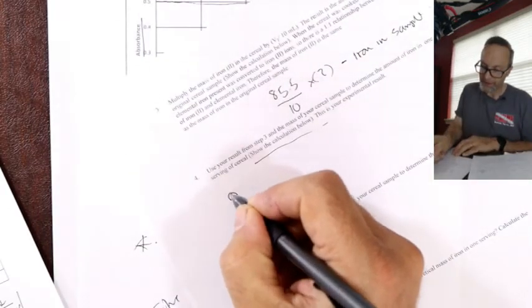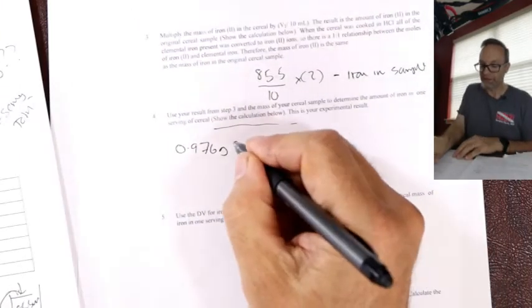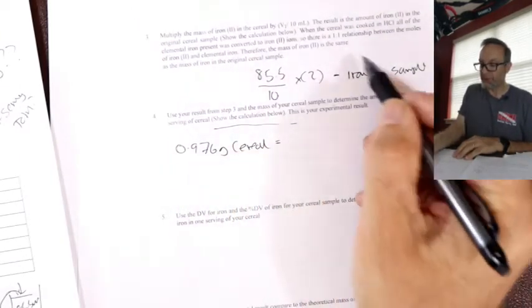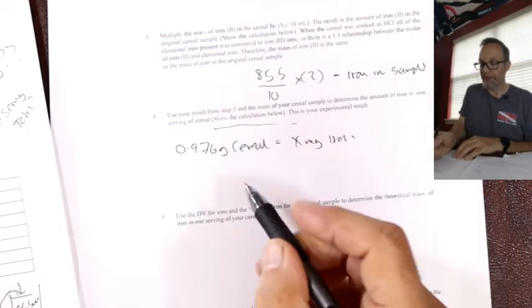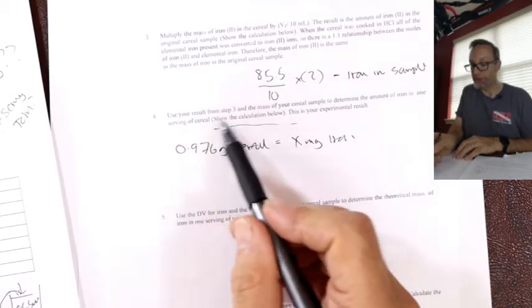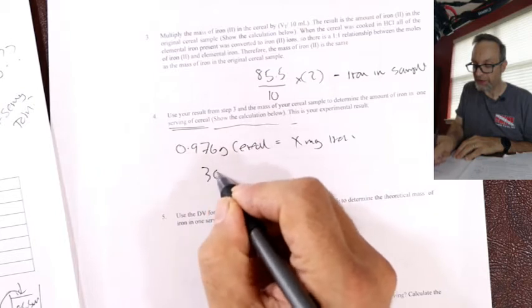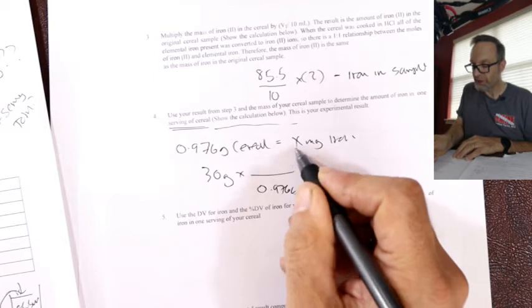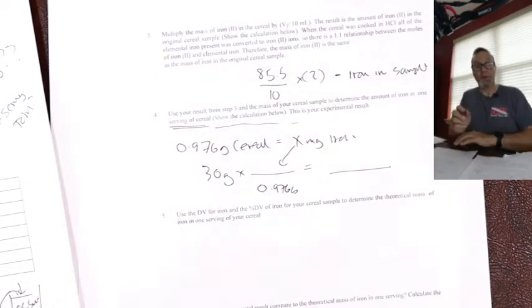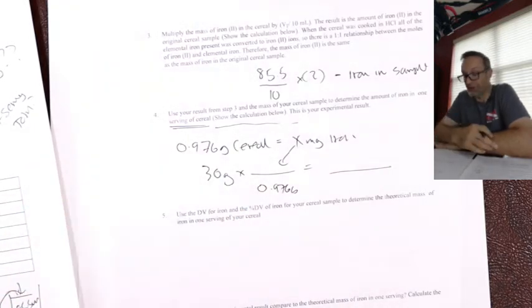0.976 grams, so you're going to make a conversion factor. 0.976 grams, your number may be different, of cereal equals the value you got here, X milligrams of iron. And then it's just a conversion. If I want the amount in 1 serving, I need it in 30 grams. So 30 grams times X milligrams over 0.976 grams equals. And obviously it should be around 18, because that's what the book says, that's what the label says.